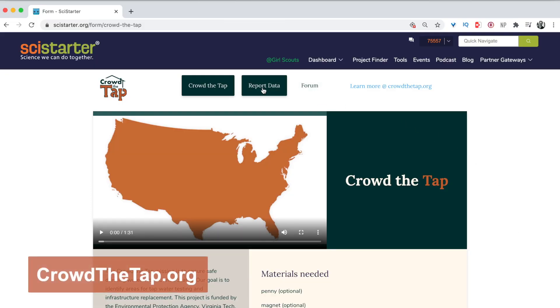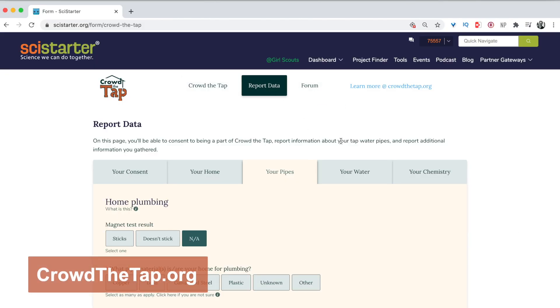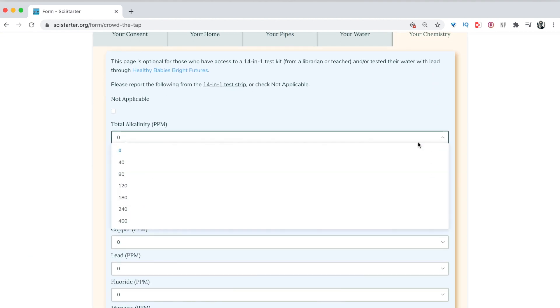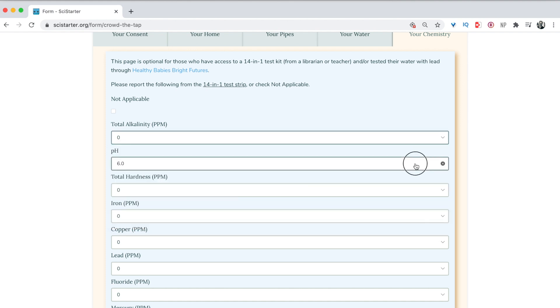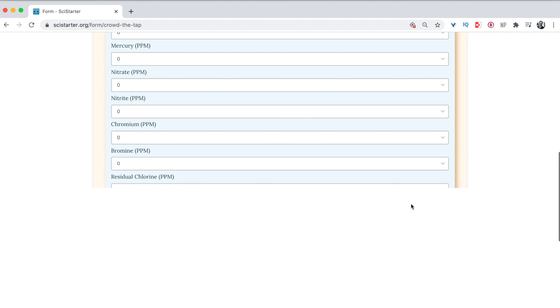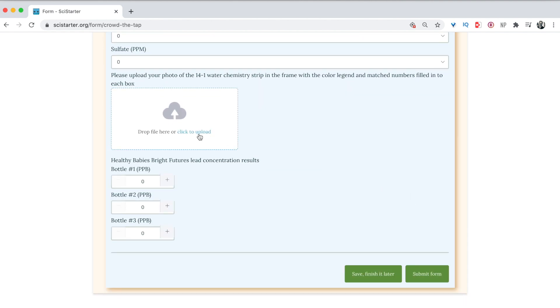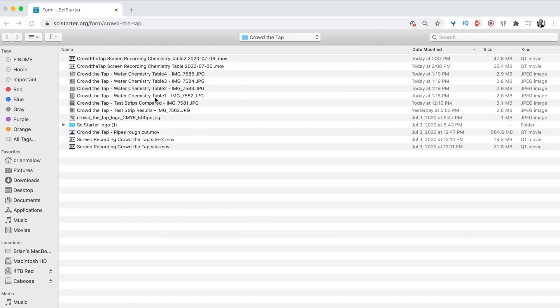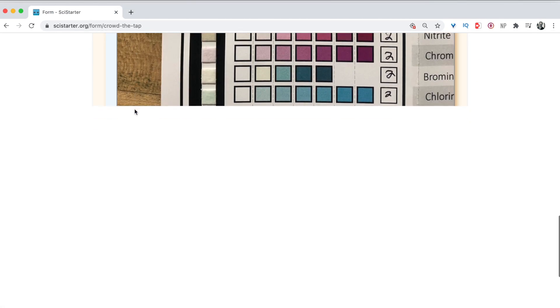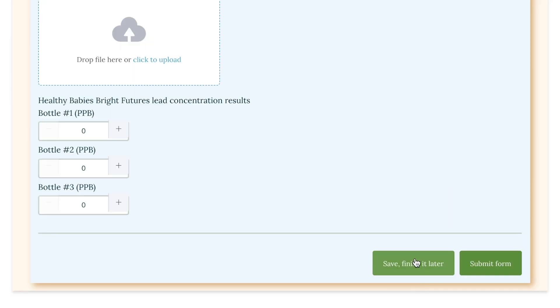Now we're going to go to CrowdTheTap.org and enter our data. Click on Report Data, then the last tab, Your Chemistry. Enter all the values you circled on the water chemistry table. Then upload your photo. If you have kit number two — the water collection bottles — you can hit save and finish it later. This is where you'll enter your lab results once you receive them.